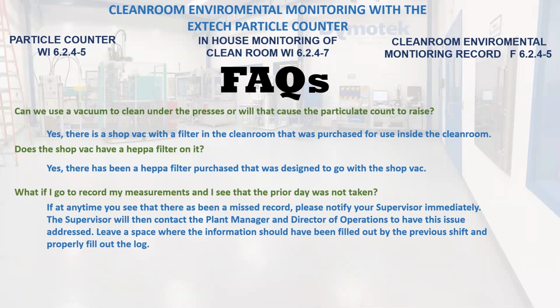What if I go to record my measurements and I see the prior day was not taken? If at any time you see there has been a missed record, please notify your supervisor immediately. The supervisor will then contact the plant manager and director of operations to have this issue addressed. Please leave a space where the information should have been filled out by the previous shift and properly fill out the log.